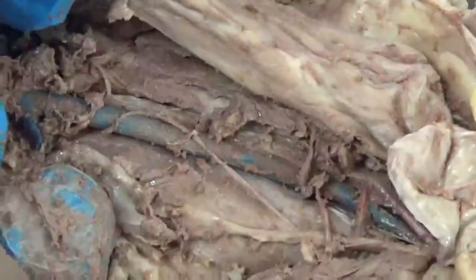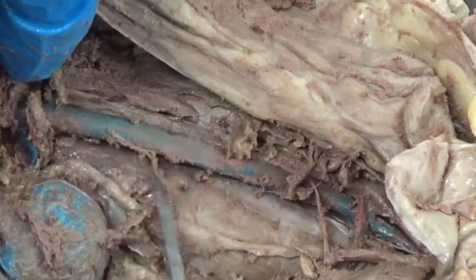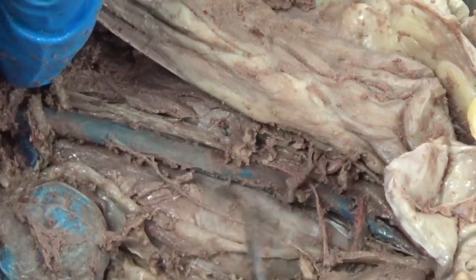Okay, so the other things that we'll take a quick look at are the blood vessels of the abdomen. The main one that you see here, the blue right here, is the vena cava. So this would be the posterior vena cava.